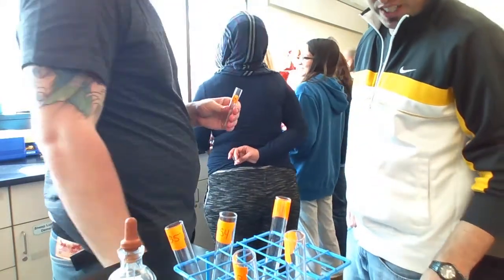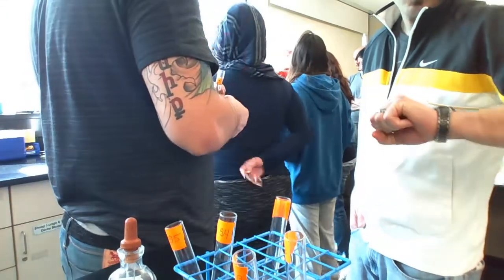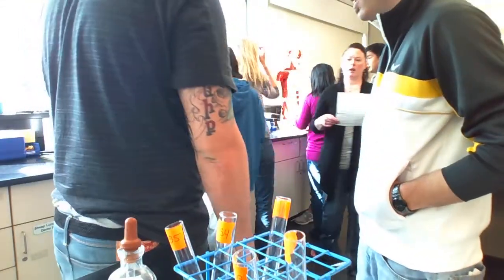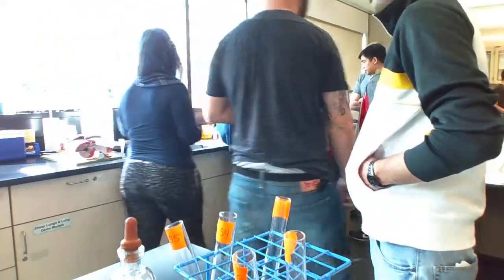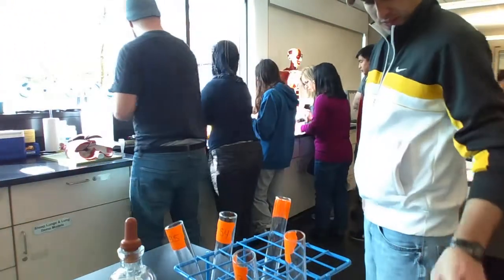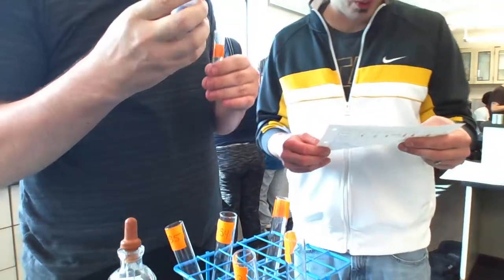Sam, are you boiling number 3 yet? We should just look at it. So there's 5 drops. Yeah, great. Okay. Chris, there's not enough room for the entire block. Are you litmus creaming? Okay, so tube 2 will get 5 drops.